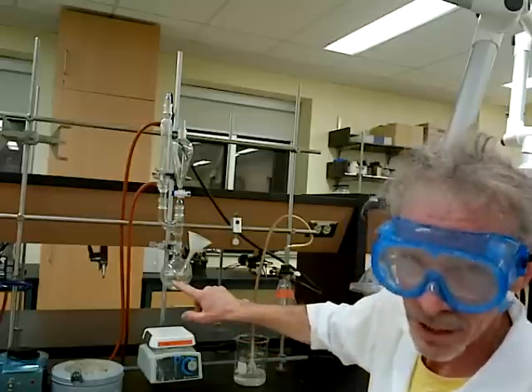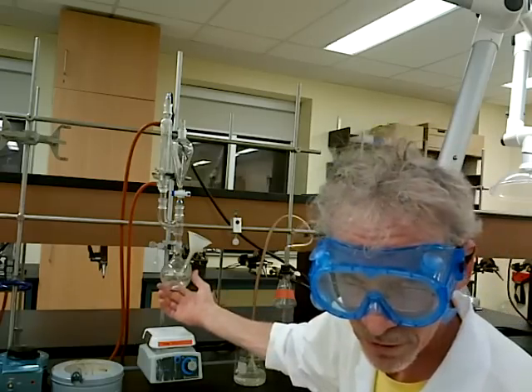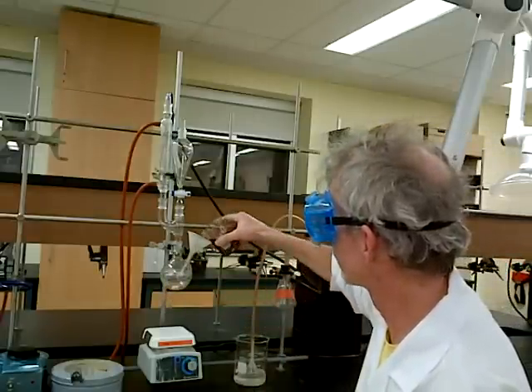So, what do we have to do? We have to put concentrated hydrochloric acid, concentrated hydrobromic acid, and butanol in here. I just happen to have them right here in this beaker — in they go.